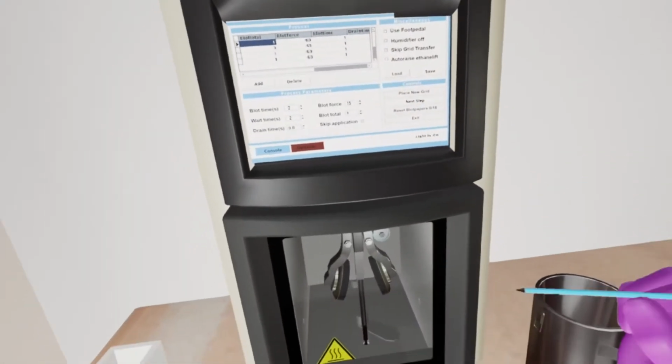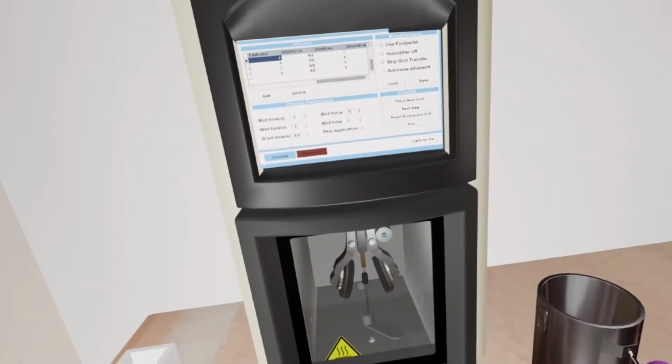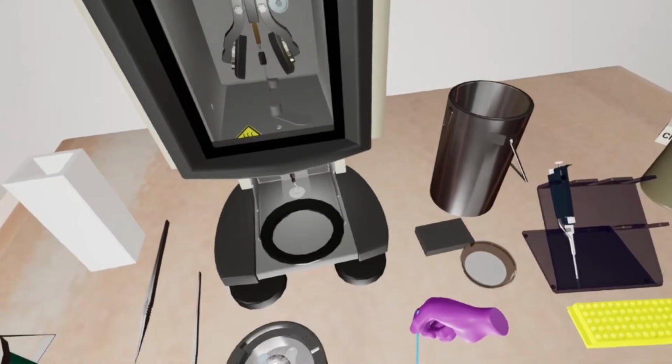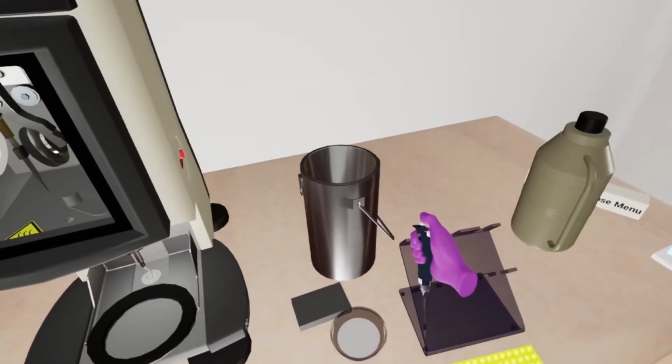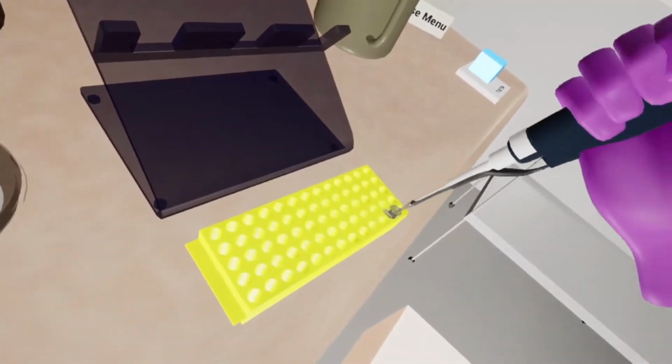Use the stylus to press the button that says Start Procedure on the Vitrobot screen once to raise the plunger. Now, pick up your pipette. Use the pipette to pick up your sample from the yellow.